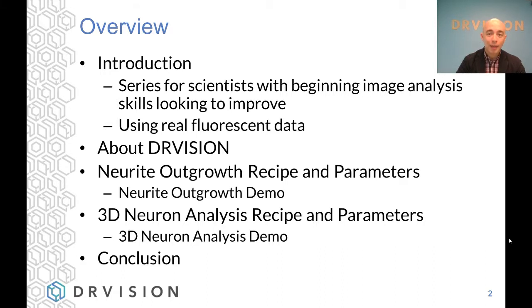This is not a math-intensive theory-first course. There are some great resources out there, and if that's the thing that interests you, I do recommend you check those out. But this will be focused on some of our actual recipes and their parameters. We're going to talk a little bit about who we are as a company and what we've done. And then we'll, of course, get into the meat of the presentation with a Neurite Outgrowth 2D application.